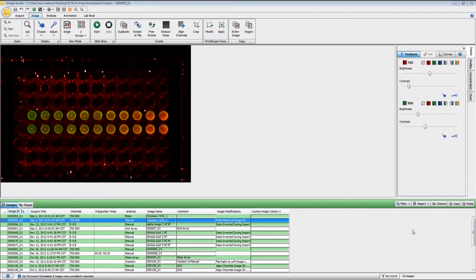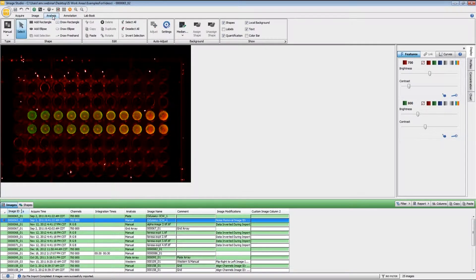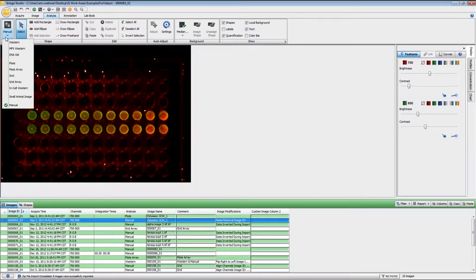In this video, I'll be showing you how to utilize the functionality of the InCel Western Analysis ribbon. We have a plate here, and if you have not previously applied the InCel Western Analysis — if you didn't do that at the time of acquisition — you can simply add that by going to the Analysis ribbon and here under Type, you're going to click on InCel Western.